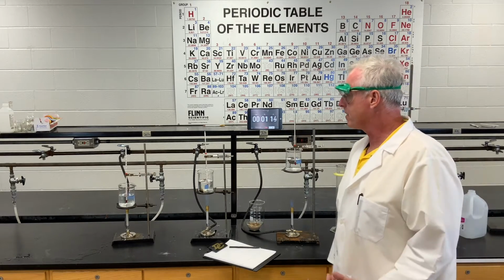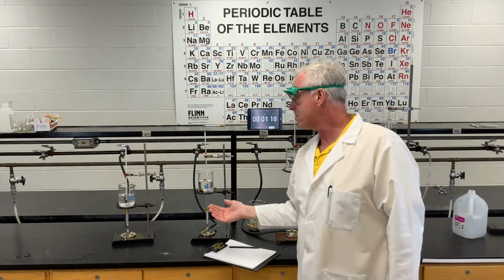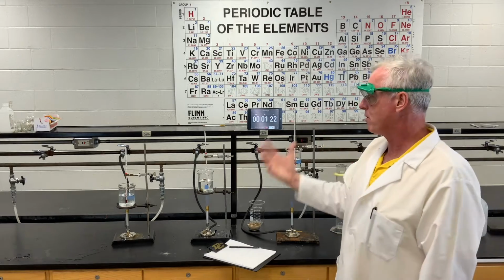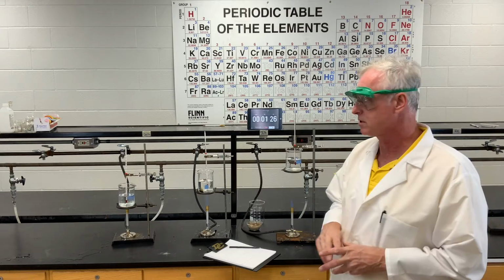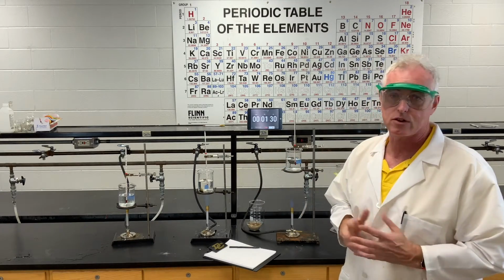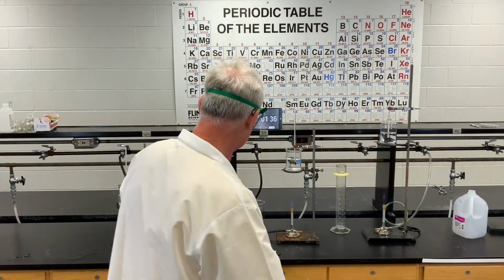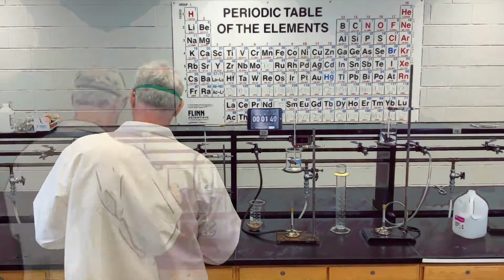And the dependent variable can be thought of a couple different ways. For us, we're measuring how long it takes for the water to heat. So technically, that would be our dependent variable. But in this case, you can also think of the dependent variable as which spot in the flame is the hottest. So a couple different ways you can look at that. We're gonna let this go for a few minutes. I'm gonna keep an eye on the temperatures and make some records just to see how things are going.